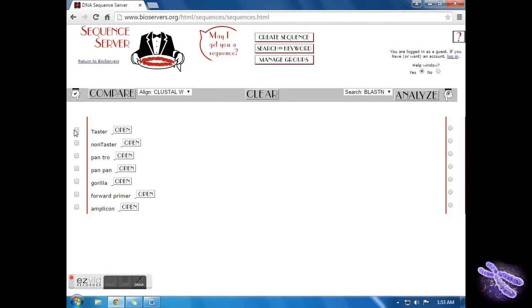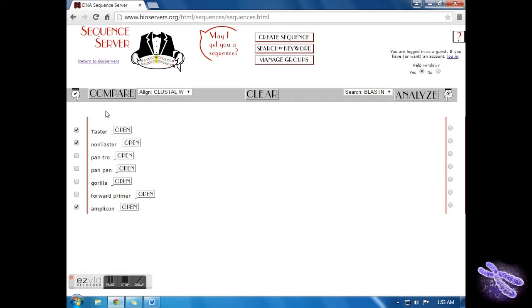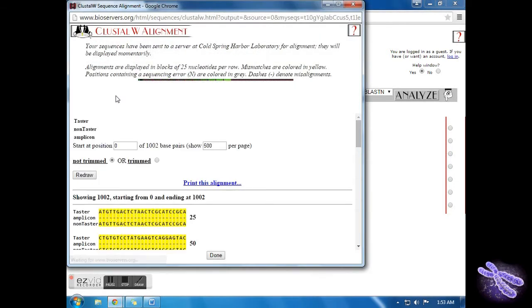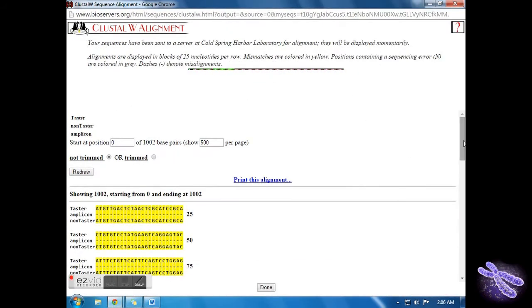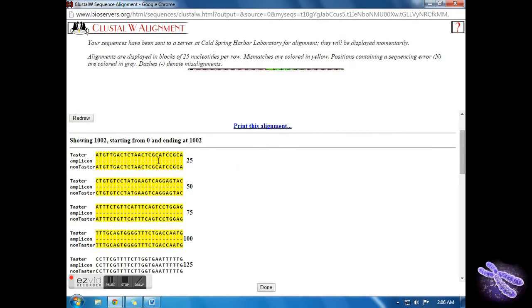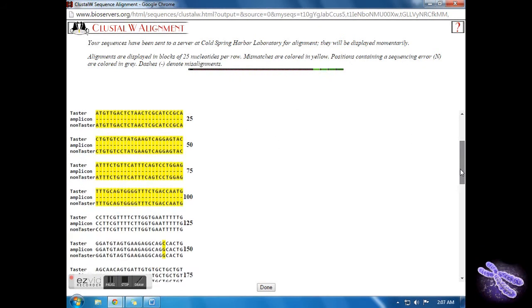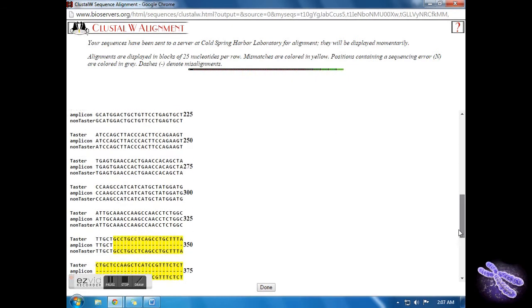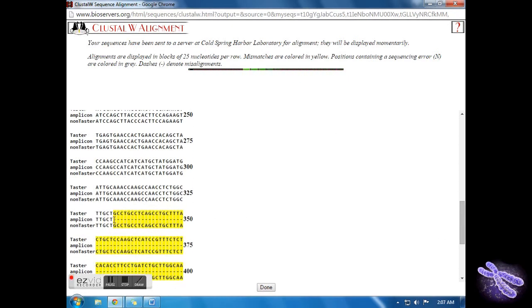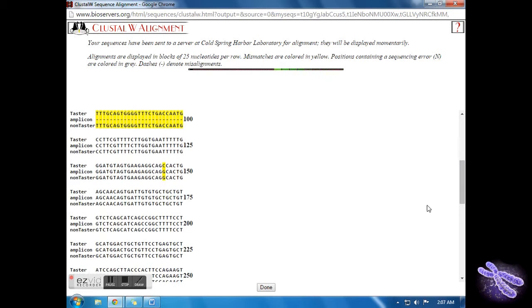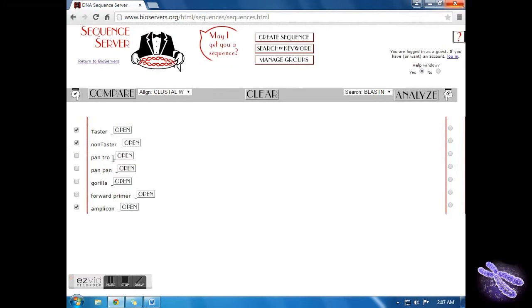Select the boxes next to TASTER, non-taster, and the amplicon, and then click on Compare. The yellow highlights indicate mismatches between sequences or regions where a sequence is absent. Notice where the amplicon begins and where it ends. Also notice the yellow highlight at nucleotide position 145. Exit out of the window and unselect Amplicon.